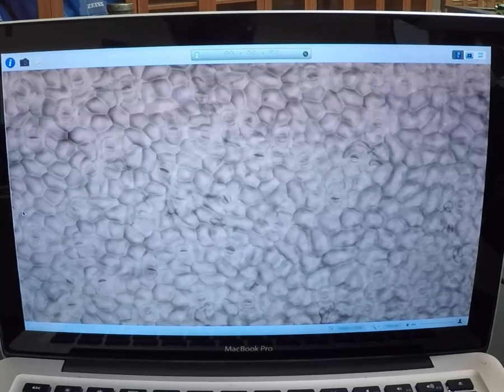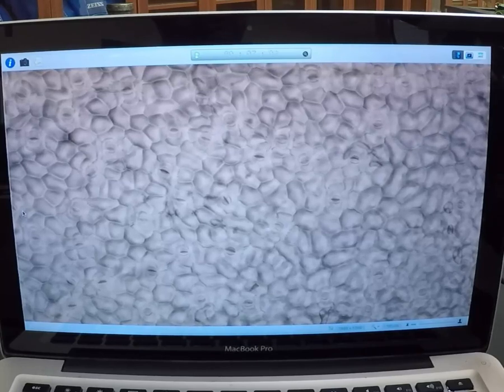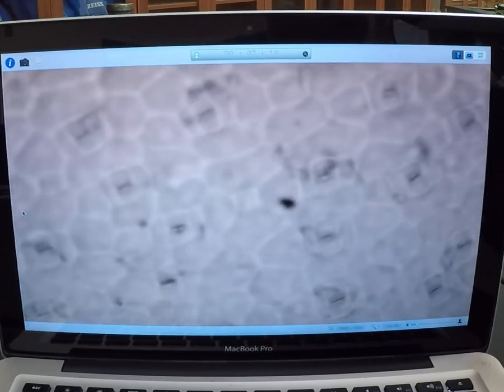So you're going to take that and use that information to see which plant has more stomata openings. So that's the money plant, species A. And now I'm going to throw on the geranium, species B, and same kind of region, same area, same magnification, and now you can see the stomata here.